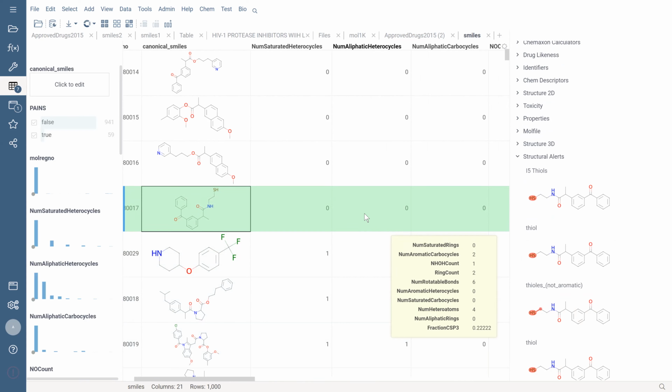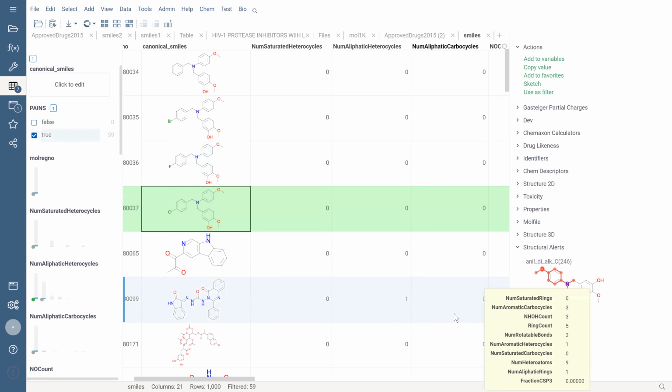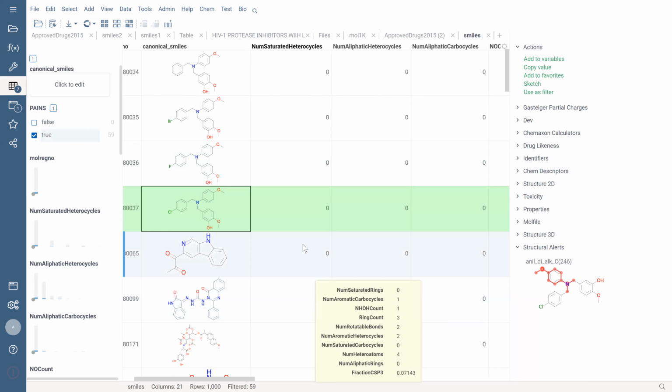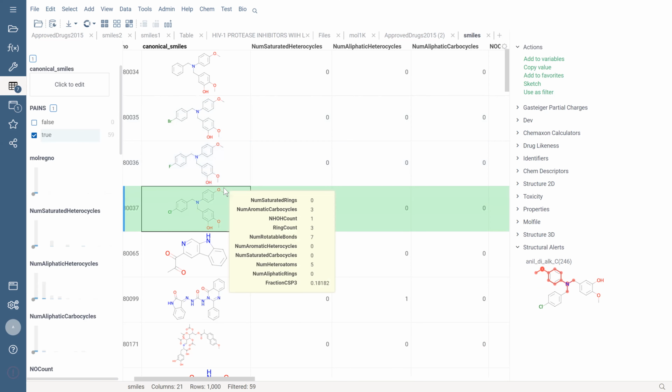Well, looks pretty cool. Just one question. When you import a file into a table, does it actually keep the original chemical structure representation, or does it do any conversion internally? Does it always store molecules in the original format or not? That depends. If you're using mol V3000, mol V2000, or SMILES, they are stored in SMILES, mol V2000, and mol V3000. If you use the mol2 file format, it will be converted to one of these.